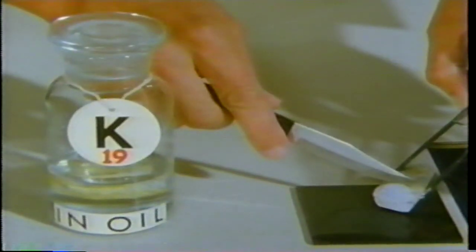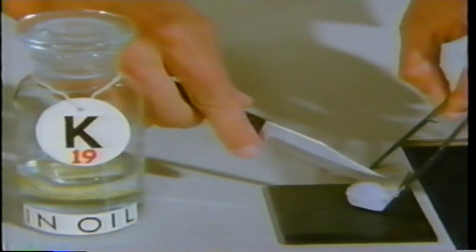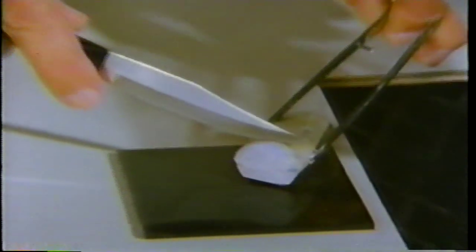Chemists divide the substances around us into compounds and elements. Let's look at the elements. Here is the chemical element potassium. It cuts easily, and its shiny surface dulls as it reacts with air. Potassium also reacts with water.